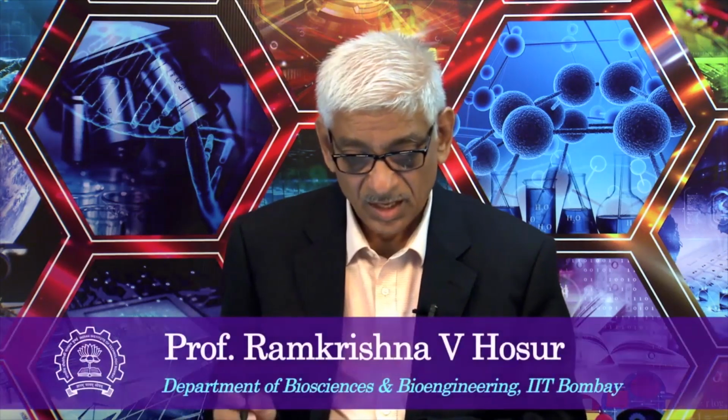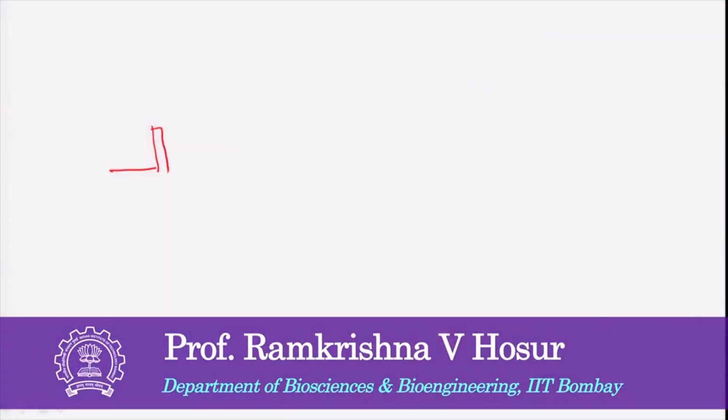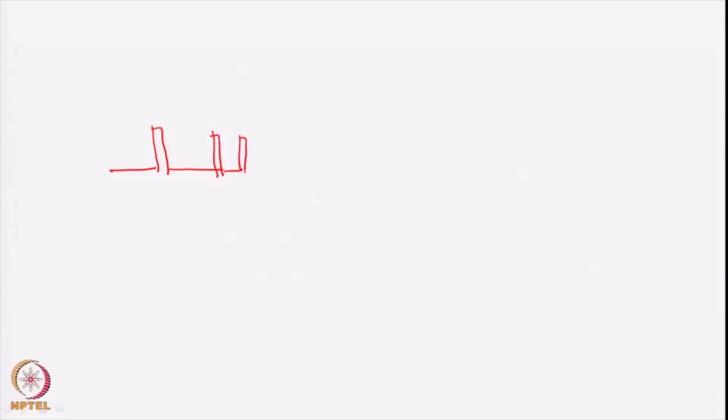In the last class, we discussed in detail an experiment called double quantum filtered COSY, and that was simply a pulse sequence which was like this. We had 3 90-degree pulses. This is 90 phi, 90 phi with a phase of phi, and this is 90x, and the data was collected here. This is the t1 period and this is the t2 period.